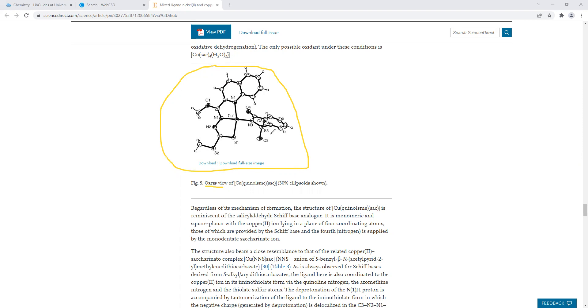That's how we use the Web CSD, that's how we search for the metal saccharinate complex, and these are the different sections that we look at when summarizing this article as a paragraph in our Lab 5 introduction of our lab report. I hope this was informative, and as always, if you have any questions, feel free to reach out. On that note, Dr. Armand signing off.